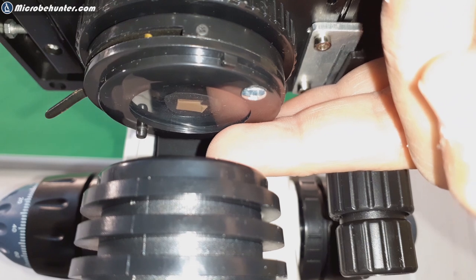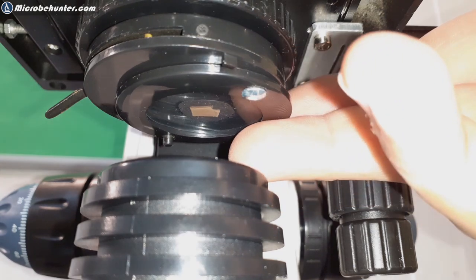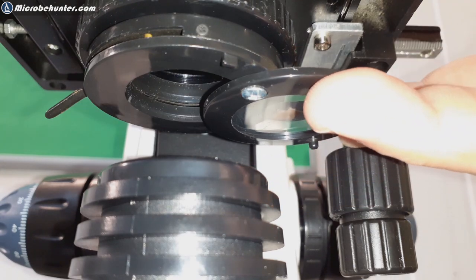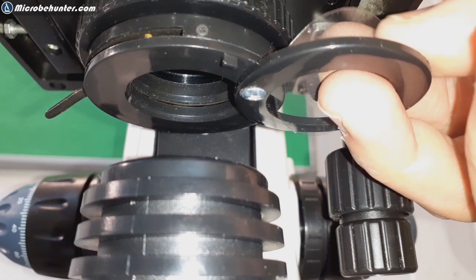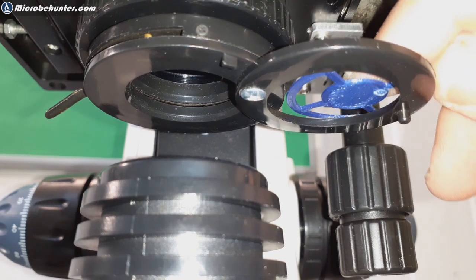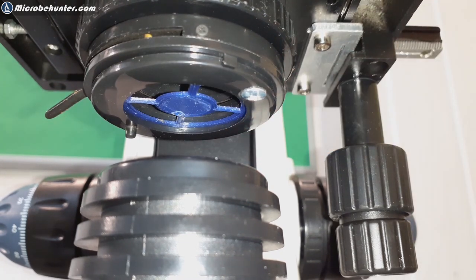Then you open it only a little bit. That's oblique illumination. So basically, this gives you a slight three-dimensional look. And if you open it all the way, then you have a regular bright field. So you see, you might as well just leave the filter in there. I tried this one here as well, and this one gives a slightly bluish background. This looks also quite nice.